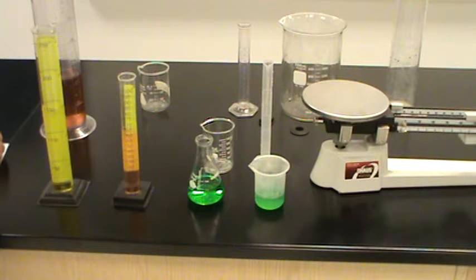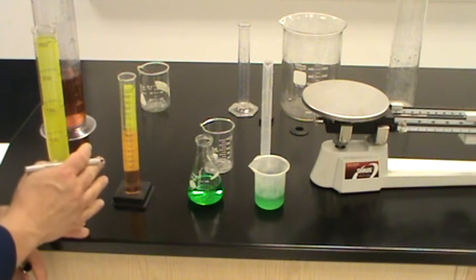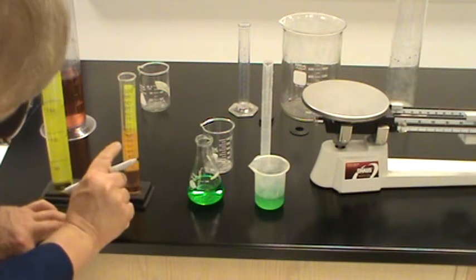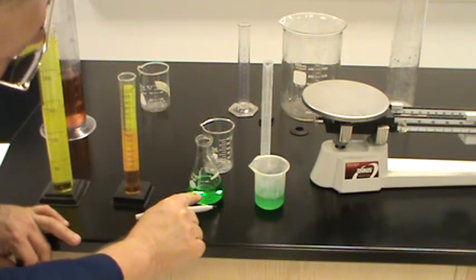And I asked you to use the whole numbers on this because, as you can see, some of these don't stand quite straight up and down. This one's at the 60 milliliter mark. I indicated that this was at the 75, which you can see.